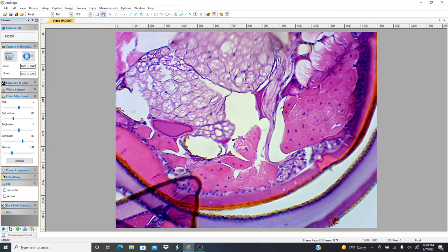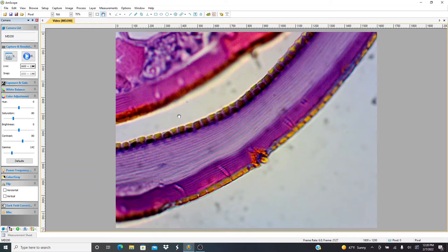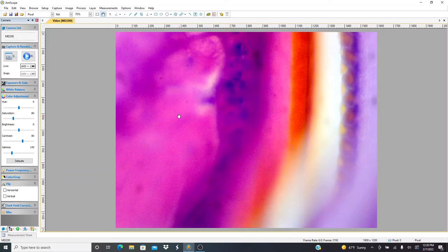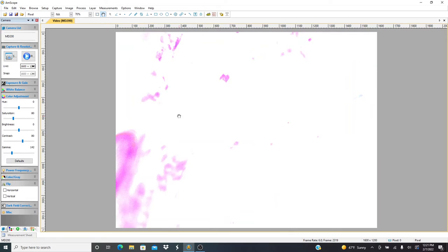There's a sort of chitin layer inside. Look at this real close. You can see it's got this sort of laminated structure, which is the chitin, and presumably water is maintained by these cells that line it. Here is a good close up view of the cross banding of the skeletal muscle, which I think is interesting, that there's skeletal muscle inside the head. If I remember, I don't really know. I think I'm in the head.